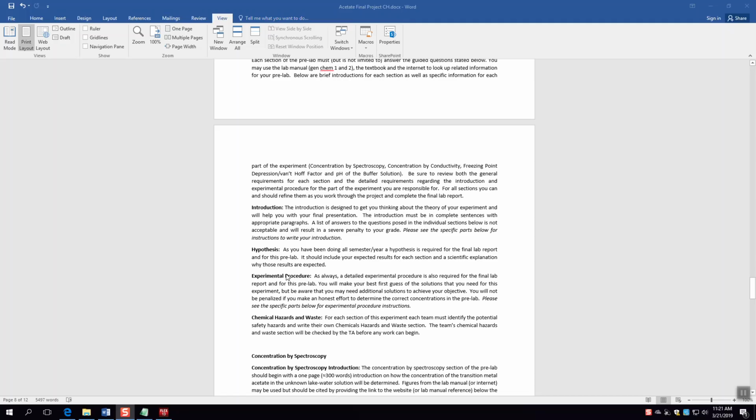So what I suggest you do is, as you go through the experimental procedure, the previous part of this section of the video, think about how you would write that in 2 or 3 sentences that express the major points of what is included in all of the things that we discussed. Things such as you're going to use 5 grams of solution should not be in your hypothesis, right? That's not a major experimental point. However, things like the supercooling, that could be there, colligative property could be there, freezing point depression could be there, and how you're going to measure that, and all this kind of stuff. So think about what the most important points are and put those in a few sentences in your hypothesis.